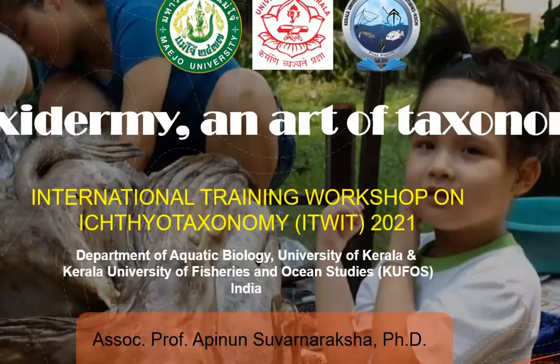Another thing is, when we go on a field trip and catch fish, I collect the fish, and not only fish, because normally we also get other things like invertebrates, amphibians, and reptiles. We collect them and bring them back to my museum. Some specimens are very nice, so how to preserve them for a long time? I also love taxidermy and bone staining of fish.